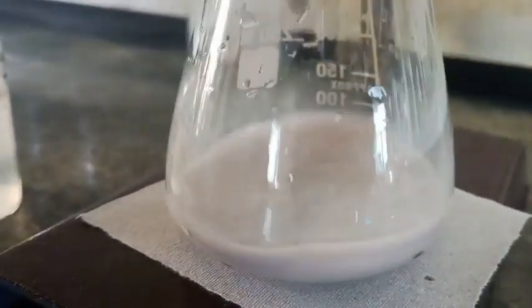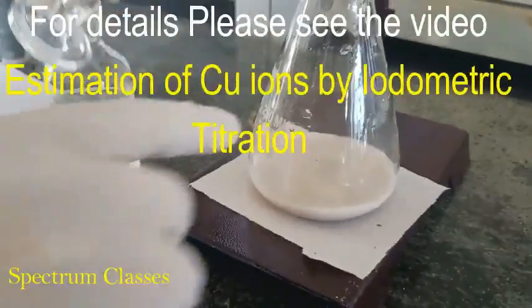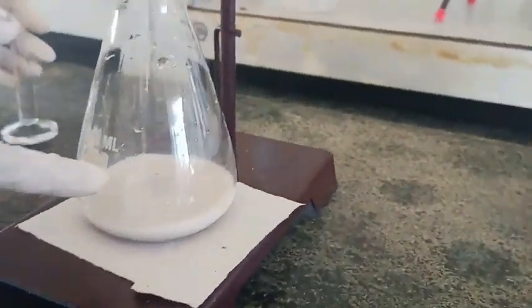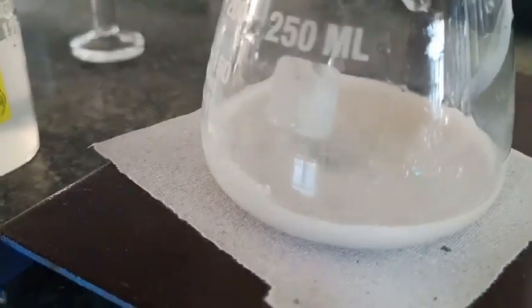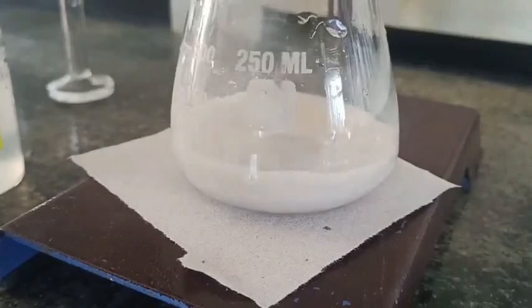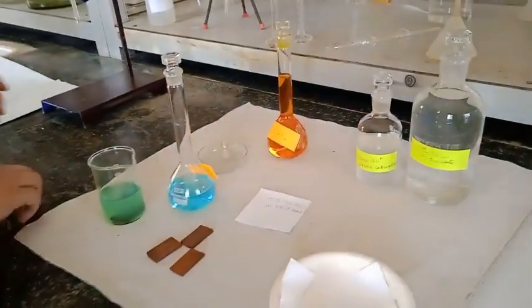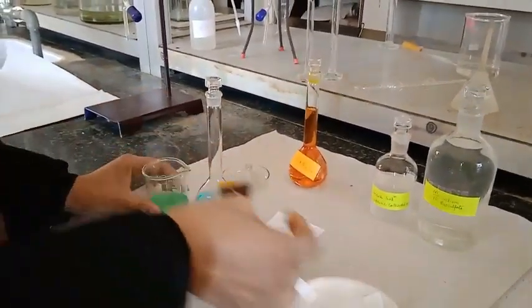But to ensure the end point, I am just going to add 1 ml of 10% KSCN solution. Potassium thiocyanate 10%. So I have taken 1 gram of potassium thiocyanate in 10 ml. And now I again start titrating. So it becomes white near the end point, and the final reading is 11.6 ml. Now I will remove this iron strip, and I have noted the time. So it takes 1.5 hours.